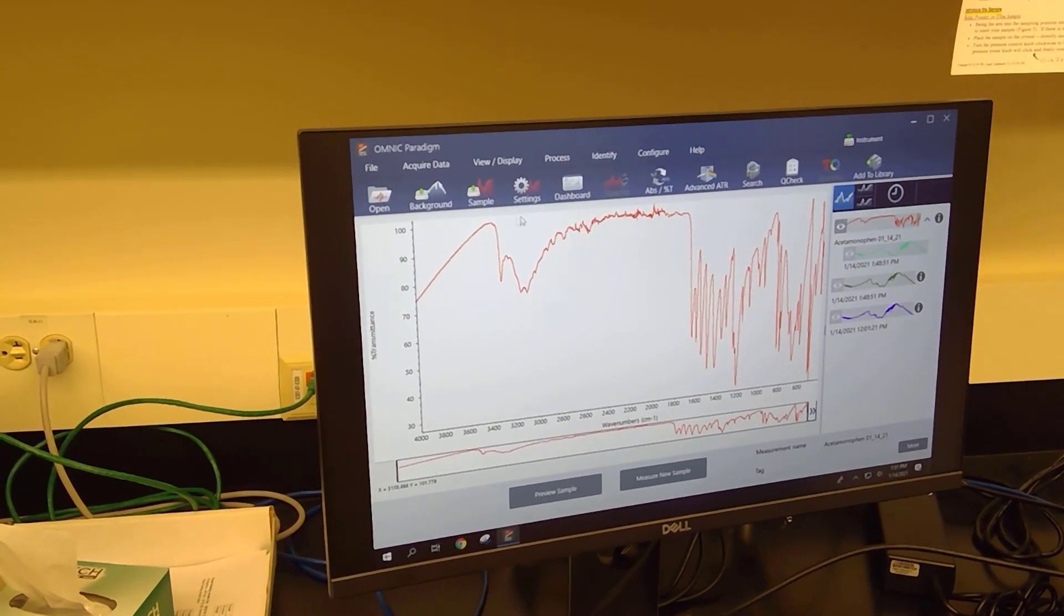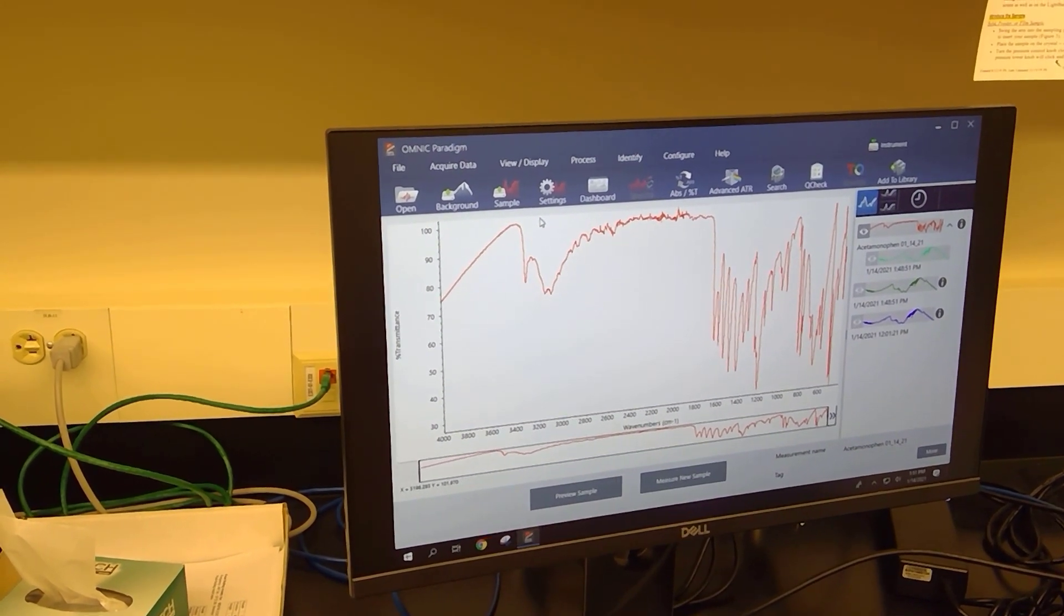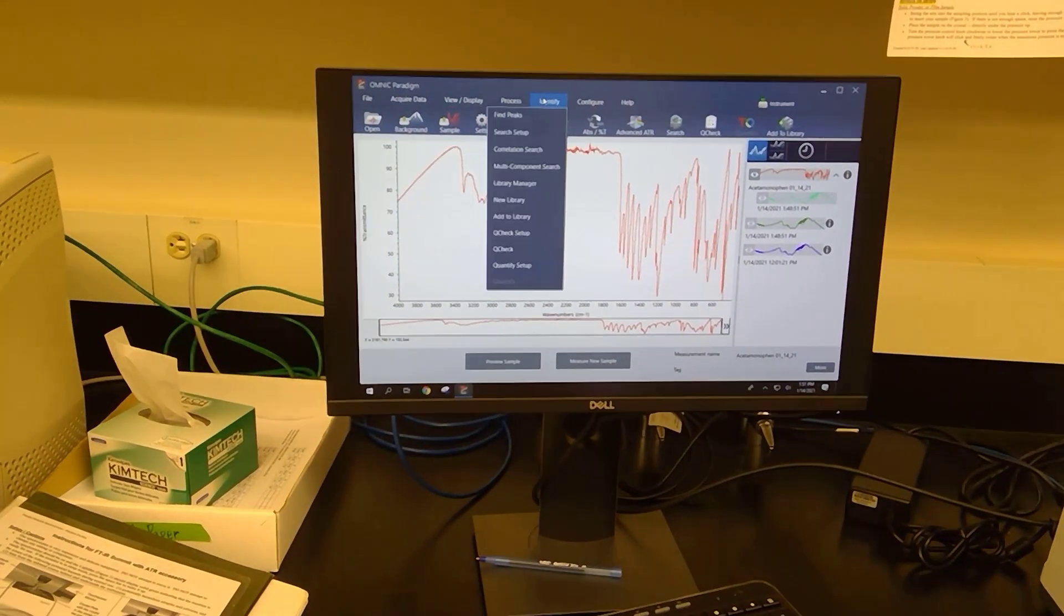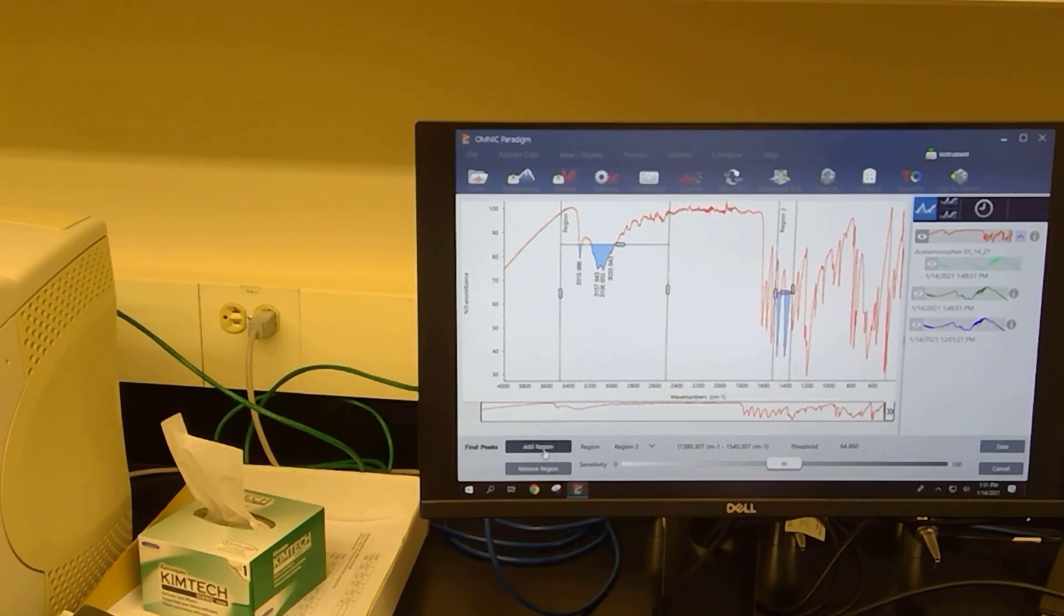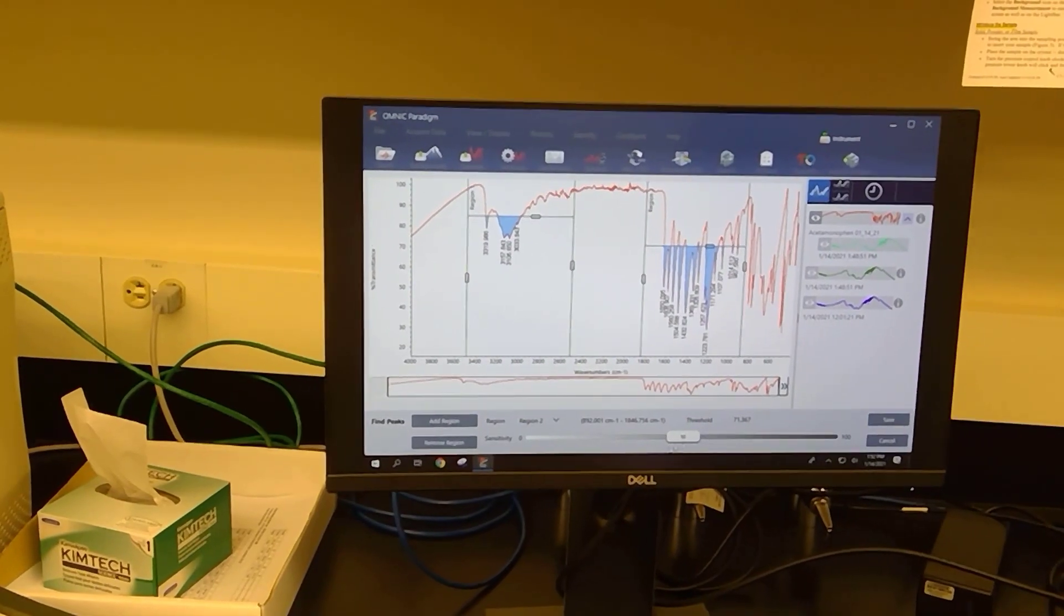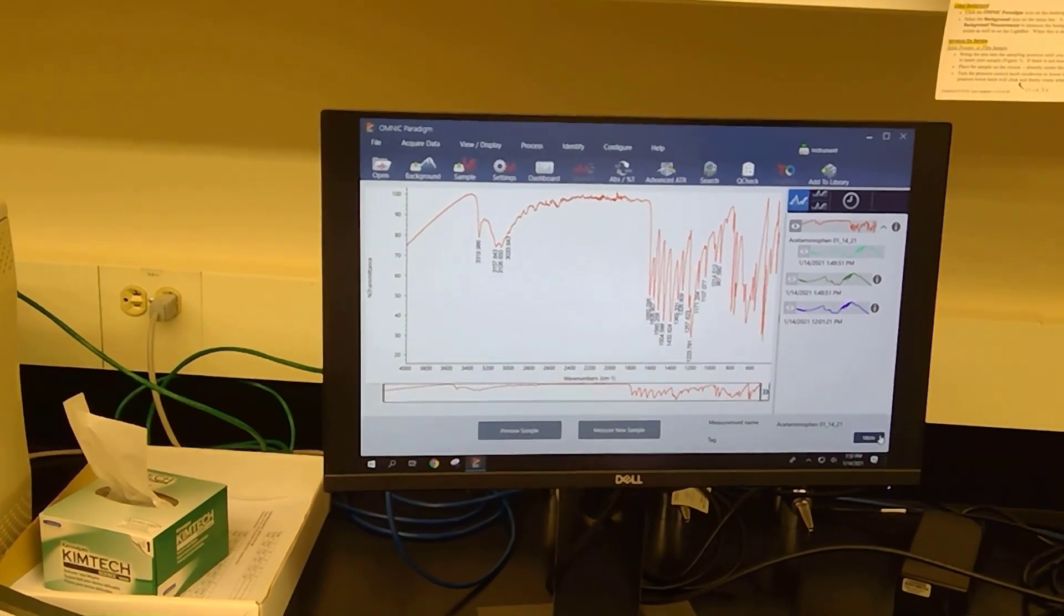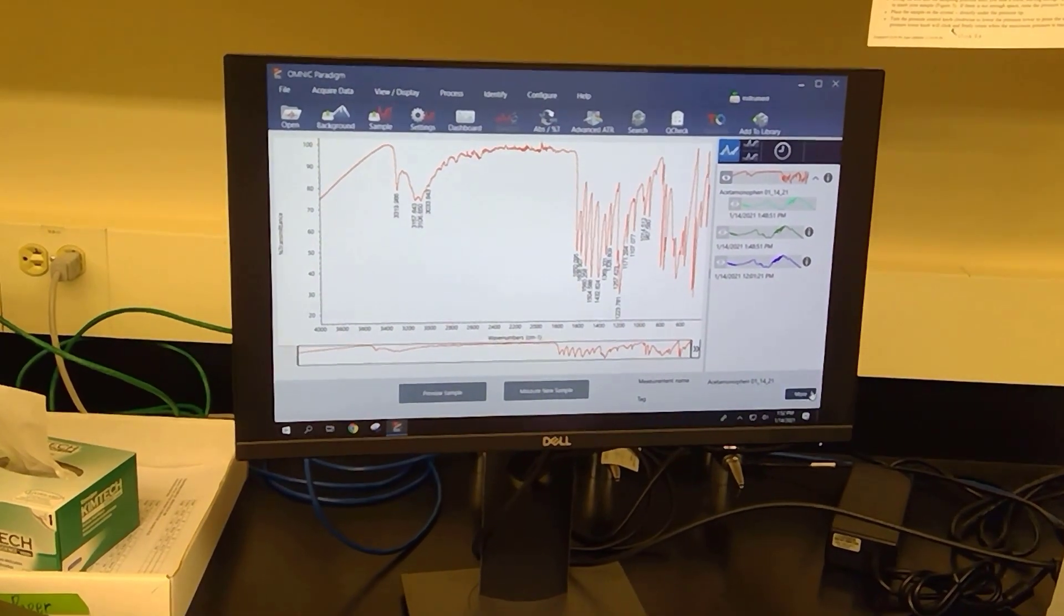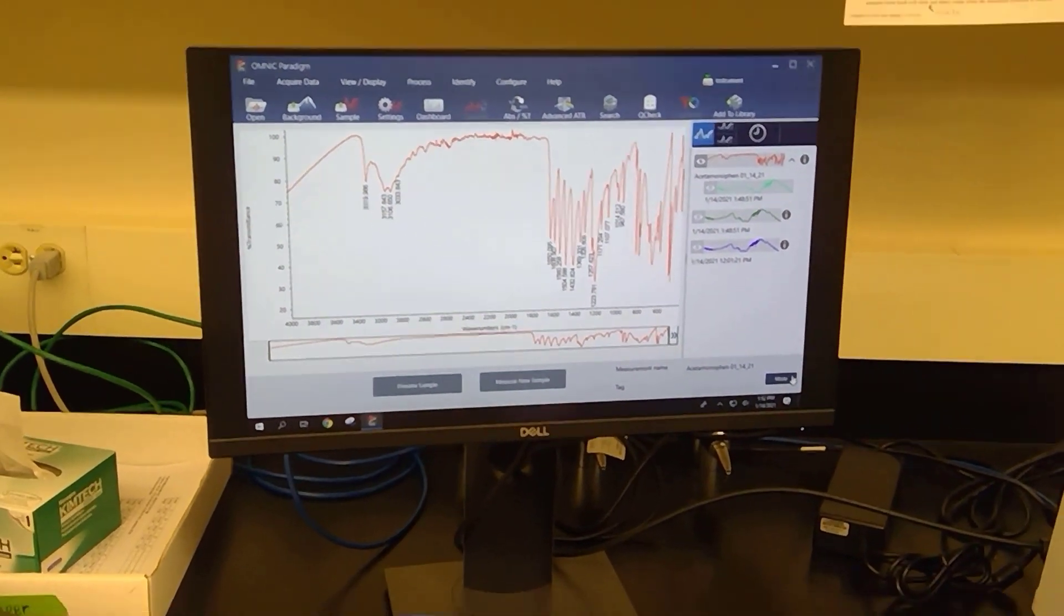Now I'm going to get some regions read for us. Let's get some identifying areas here. That's good, I'm going to add a second region. Threshold looks good, I'm going to click save. This is our infrared of acetaminophen. I'm going to email this information to myself and be able to post it on our website.